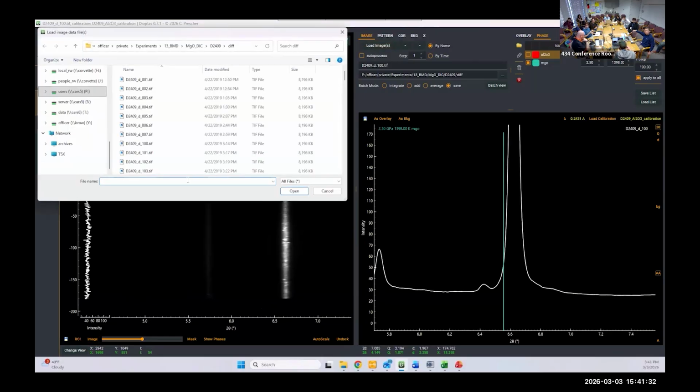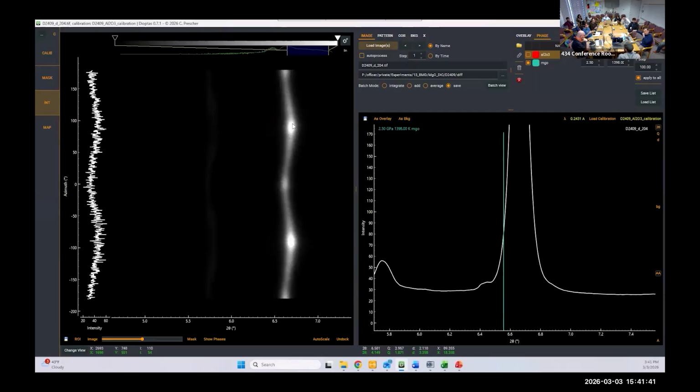But if we go to the end of the experiment and look at it again, one, we have a lot more stress, and two, we have brighter places around the ring than others. Since the orientation of the grain determines where on the ring it will diffract out to, this says that we've rotated grains and aligned them such that many more of them than when we began are pointed in a particular direction, so they're diffracting to that angle.